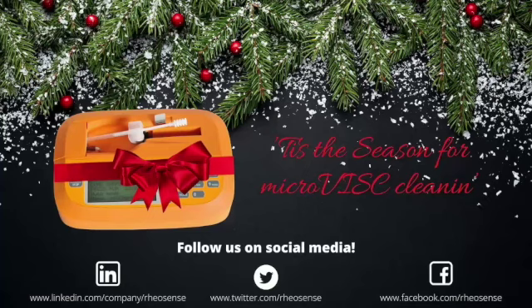And we also have another question regarding what materials you can use. Can we use gel materials on microVISC? Yeah, absolutely. So gels, you're more than welcome to run gel type materials. The biggest consideration is your maximum particle size. So as long as you don't expect any aggregation or particles greater than what the chip is rated for, it should be okay to run. As long as you have your cleaning protocol down so you don't run into any clogging, that's the most important thing.